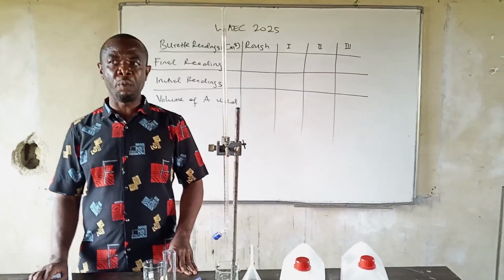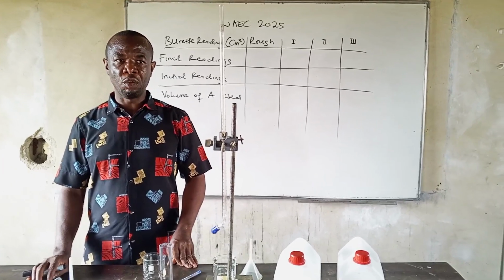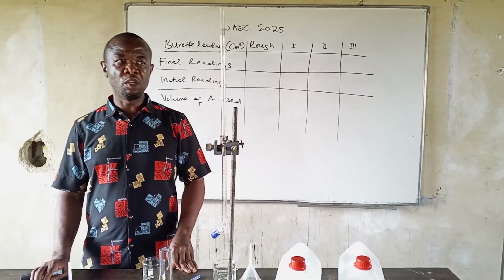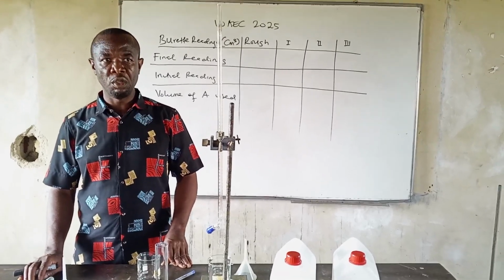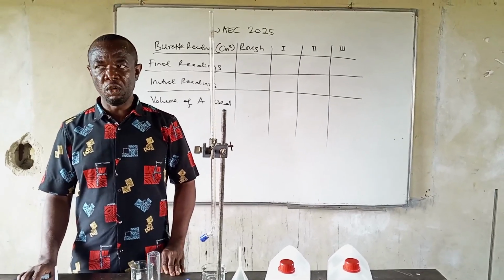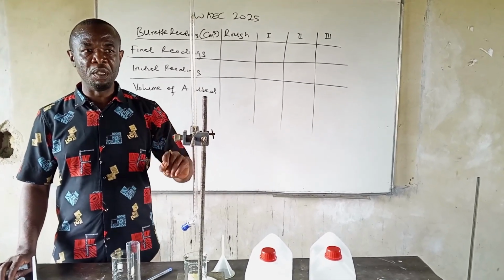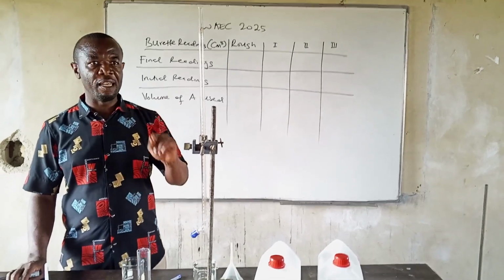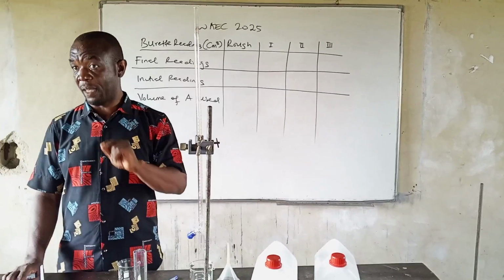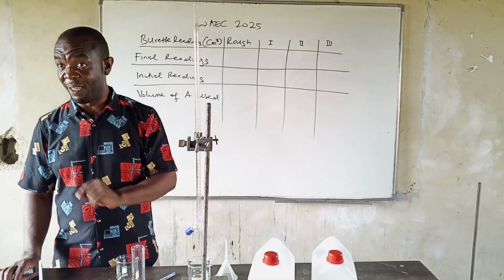where we say C aqueous plus Fehling's solution A plus Fehling's solution B plus heat. What's the observation there? Reddish brown precipitate. Also change it to brick red. So in that question C, the observation, the place you have reddish brown PPT, change it to brick red PPT. Because brick red is more technical and what we normally use in sciences than saying reddish brown PPT, so that you are not penalized in any examination.